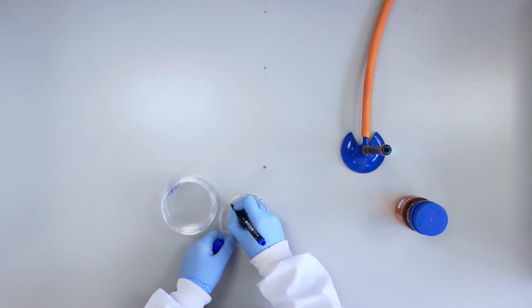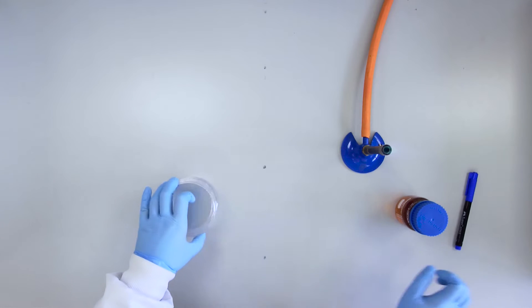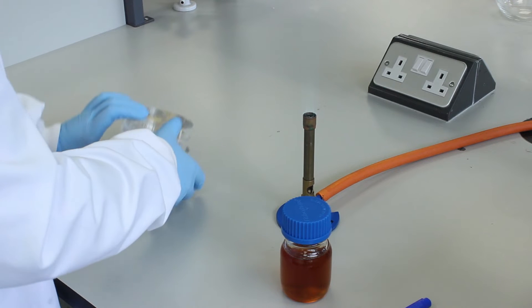The agar should still be molten but the bottle should be at a comfortable temperature to hold in your hand.